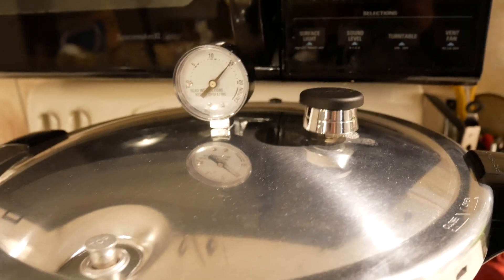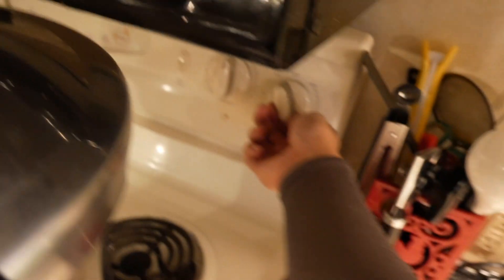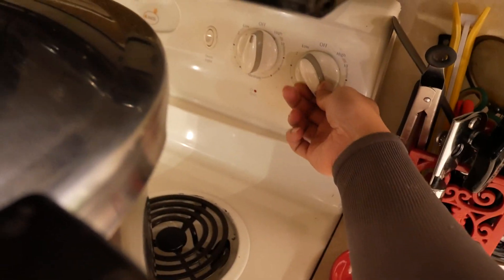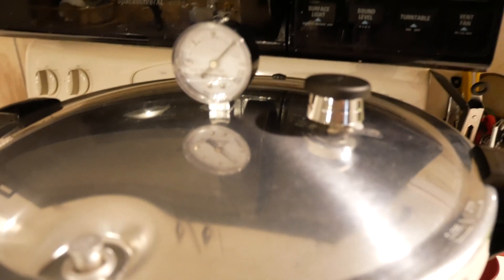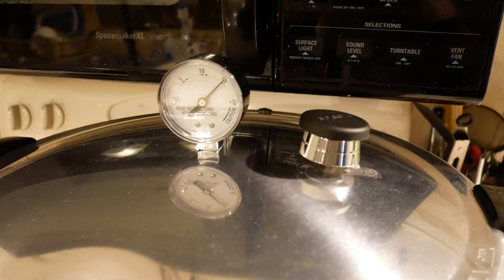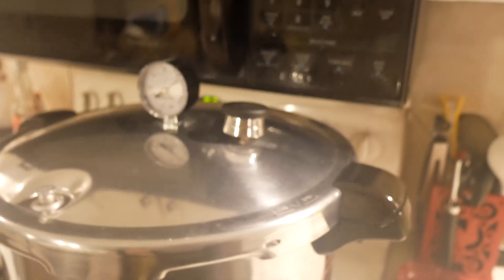Once my pressure cooker reaches 15 psi, I'll go ahead and lower the heat down to medium just to maintain it. And I'll go ahead and set a timer for 25 minutes. Once 25 minutes is up, we'll go ahead and turn off the heat and we'll go ahead and let this depressurize on its own.